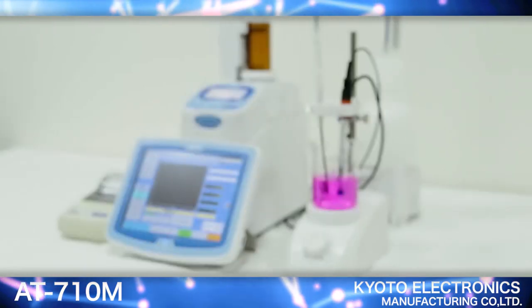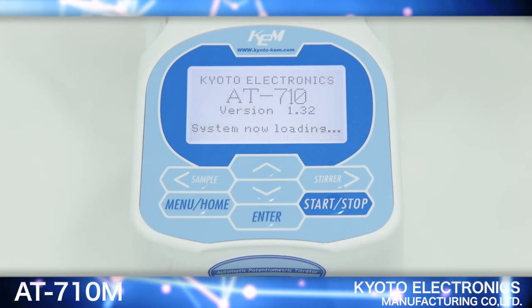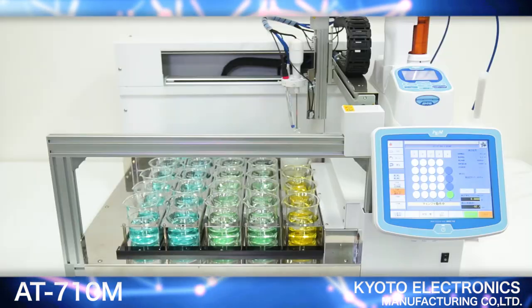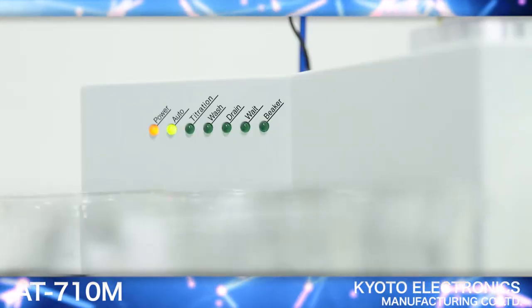The AT710M also supports wireless and LAN connections. Furthermore, by combining the AT710S or M with a multi-sample changer, you will be able to substantially increase productivity.